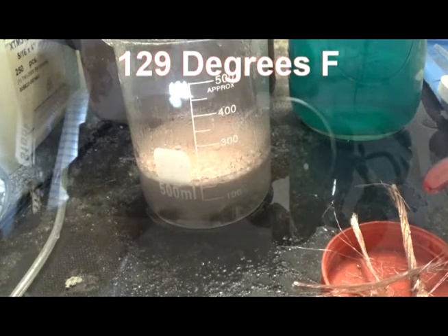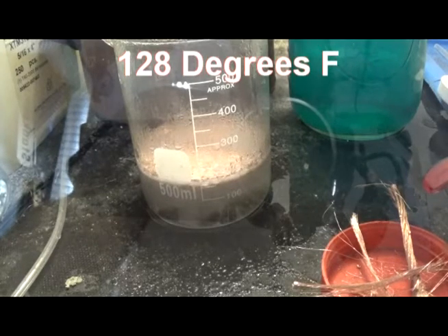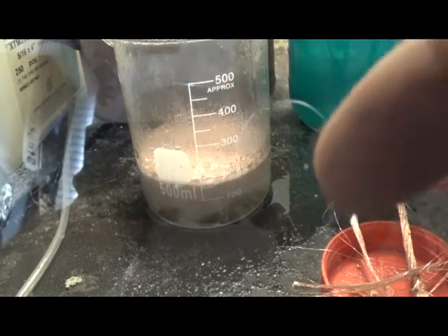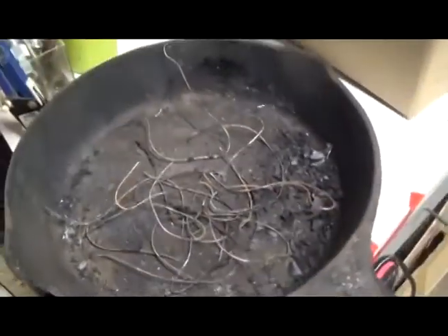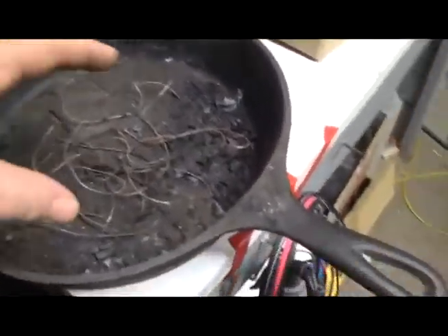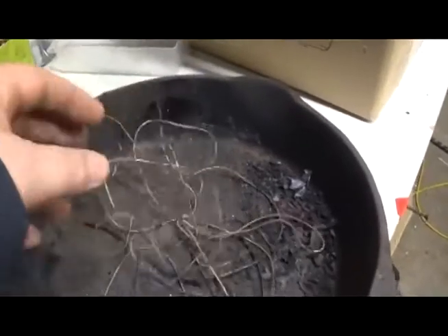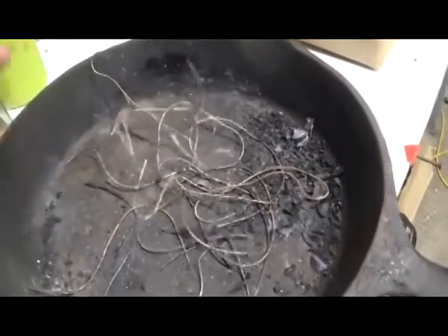We're gonna have to do a rethink on this. We screwed that first round up really — we forgot to oxidize it first of all, but it was too finely divided. Too thin, and it just ate it up.